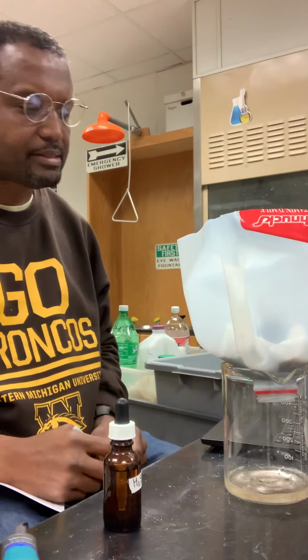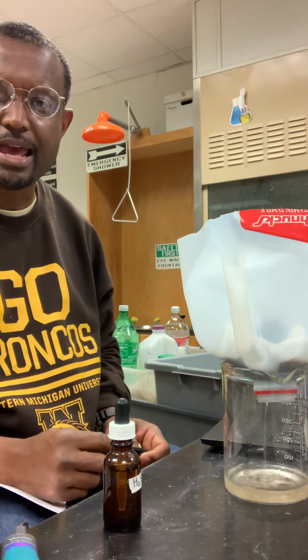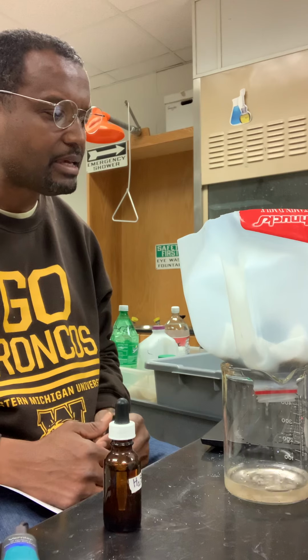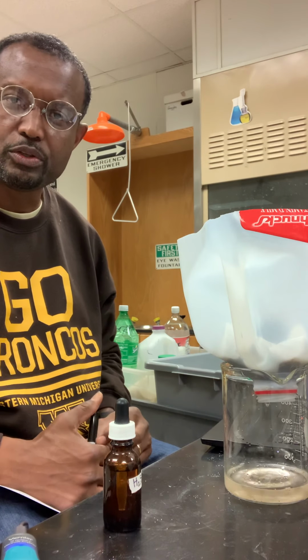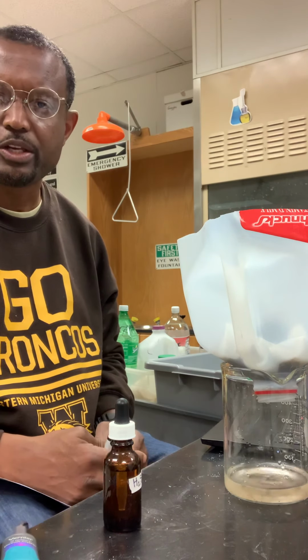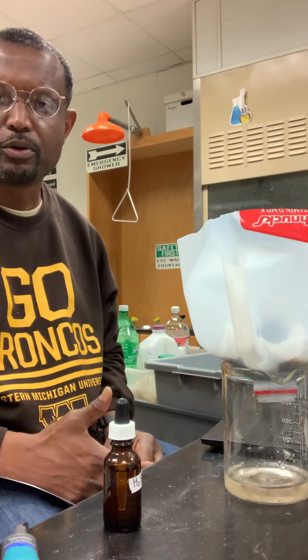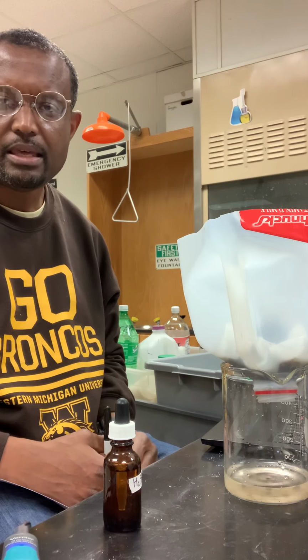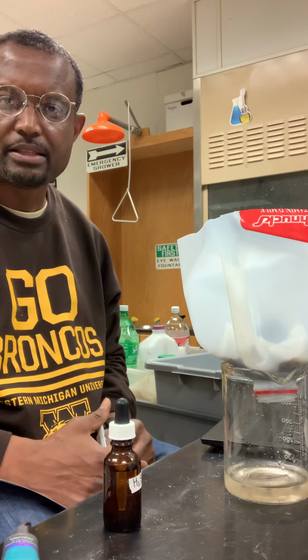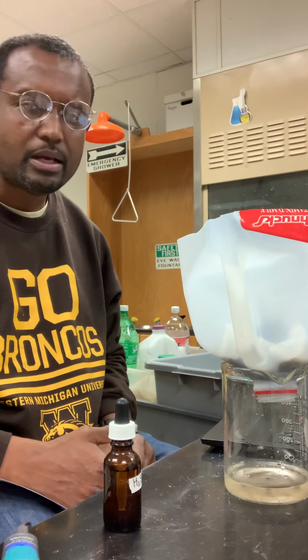And then we test the pH of the acid rain after it has gone through the soil. And so in your table, you'll notice that the pH increased to 2.06. Now, the higher the concentration of H plus ions, the lower the pH, the more acidic the acid is. And the fact that the pH increased meant therefore that some of the H plus ions are now binding onto the soil.